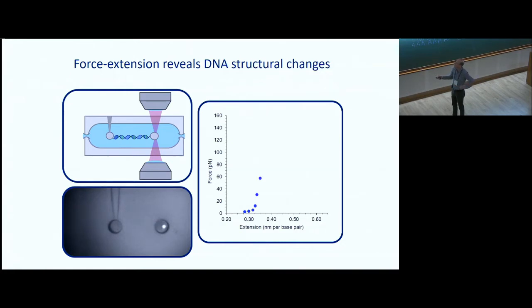So you're applying a force on this double-stranded DNA, and eventually you get to a point where you get this overstretching transition. There's going to be a whole talk this afternoon about overstretching, so I won't go into the details. Here I'm showing it as basically denaturing the DNA and melting the base pairs, and exactly what you see depends on solution conditions. There's a whole phase diagram that people haven't really developed yet, but we know that sometimes it melts the DNA and sometimes there are other structures that form, but those structures are very close in energy to DNA melting.